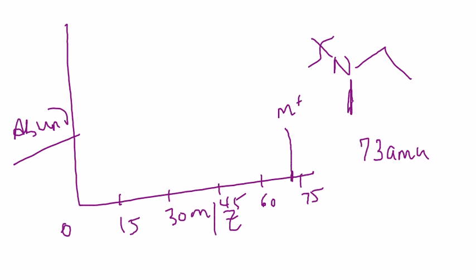even number of fragments. So one thing that one can perhaps see, even fragments coming from an odd molecular ion, and the moment you see that, you would say that it will contain an odd number of nitrogen atoms. So it's a handy rule to think about if you're not given a molecular formula, but you're only given pieces of other forms of spectroscopy.